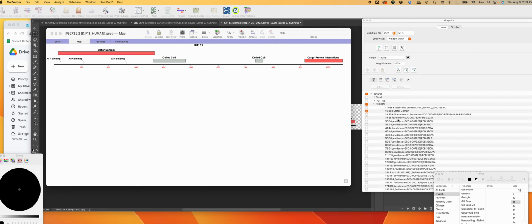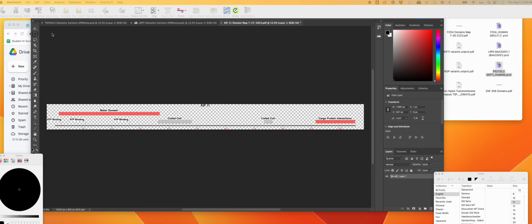you might get a ref sequence from the protein sequence at either NCBI or also Ensembl. It may or may not have some of the features you want in there, but you can edit these in MacVector. So some of these I've specifically noted these domain regions and adjusted the fonts, etc. In MacVector I can copy this, literally just copy and paste it, usually from a clipboard into a new PDF image or into a new image in Preview program on the Mac, and I save that as a PDF. And then this is where we get to the PDF.